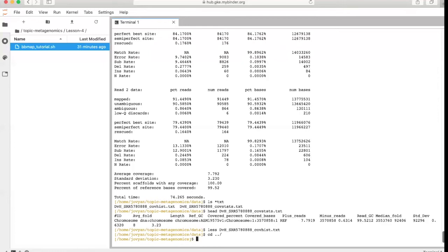So you don't have to sit there and write, I don't know, like the last project that I was working on had 48 paired read files. So I'm not going to sit down and write 48 comma separated file names. Could, but I'm not going to do it. So this is how I chose to do it.